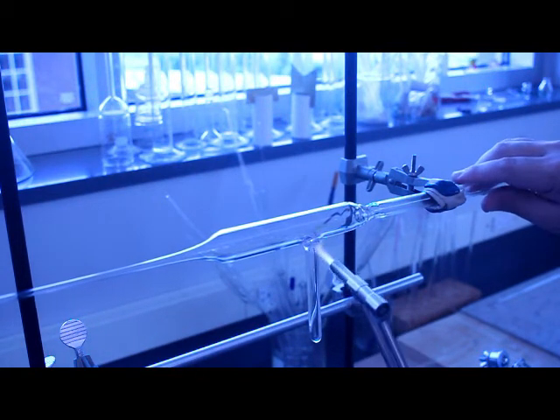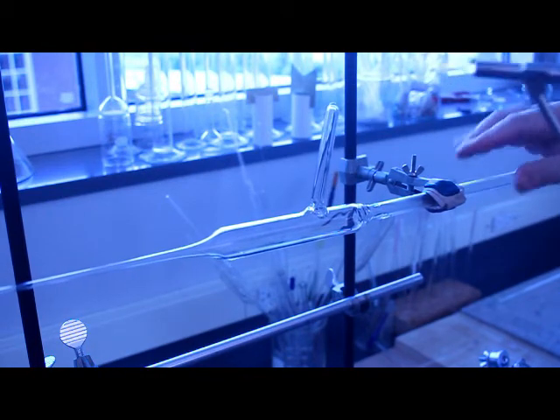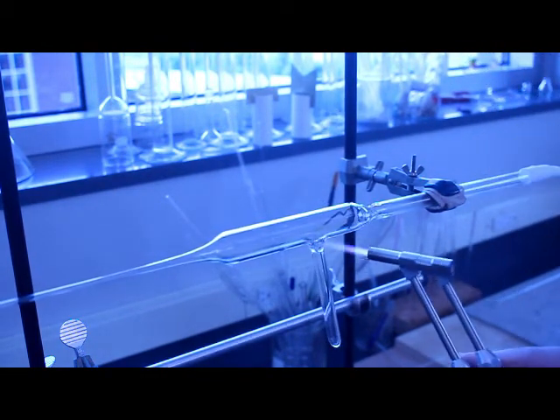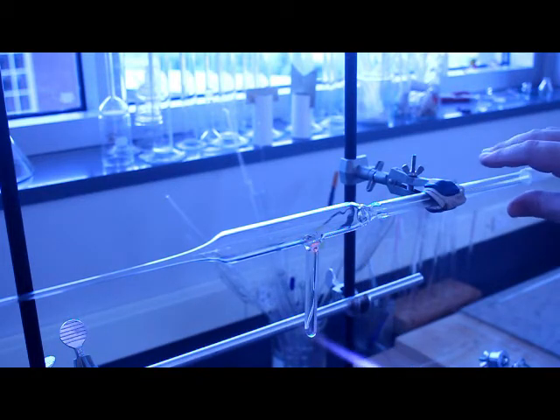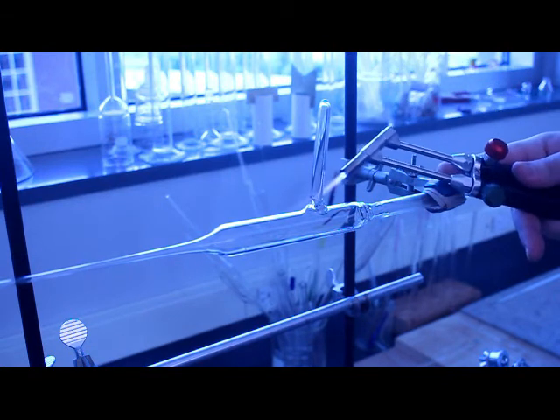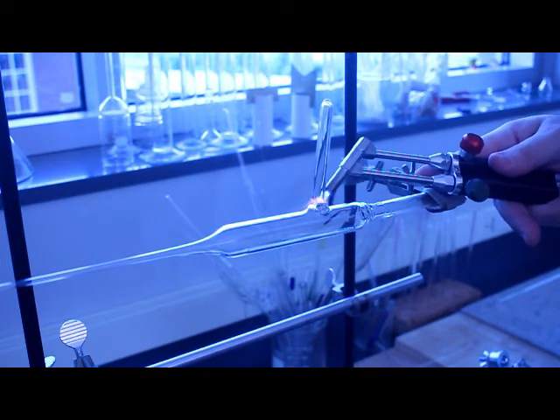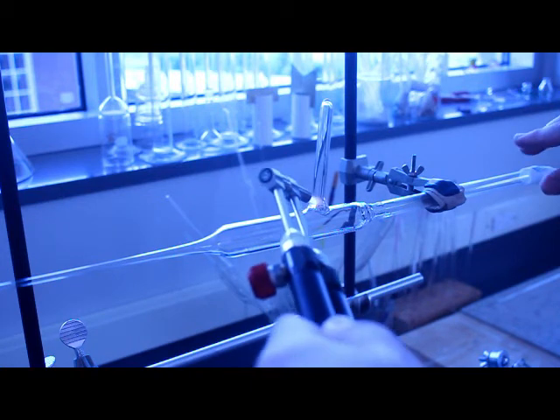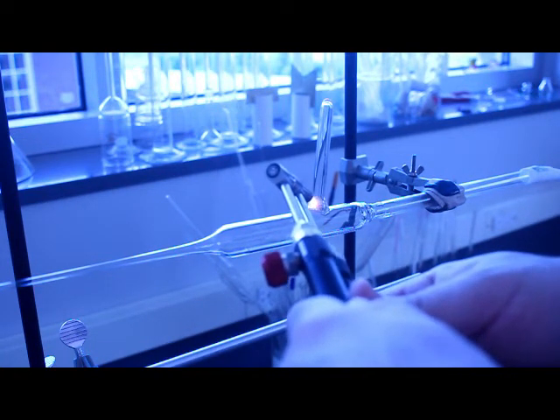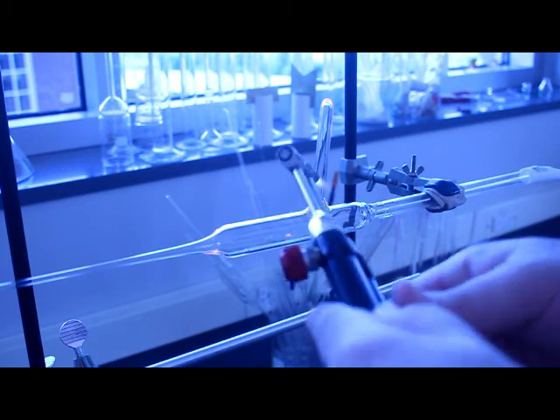Because these glassblowing skills traditionally were taught to chemists, and what I mean traditionally I'm talking pre-1960s. But over the last several decades scientific glassblowing has become more and more rare as far as being put into the curricula. I did not have scientific glassblowing when I was an undergraduate. I picked up a few techniques when I was in graduate school not because I wanted to learn glassblowing but because I needed it for my research. So this will be one of many videos I hope to be putting on this channel in the future, going through techniques and pitfalls, mistakes you make, mistakes I make, and how to get around them as best you can.